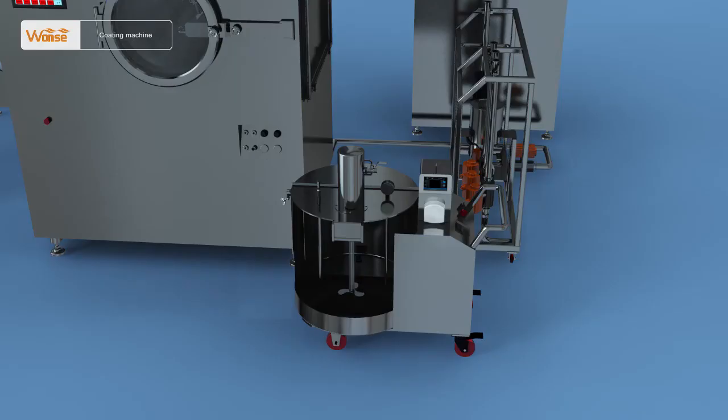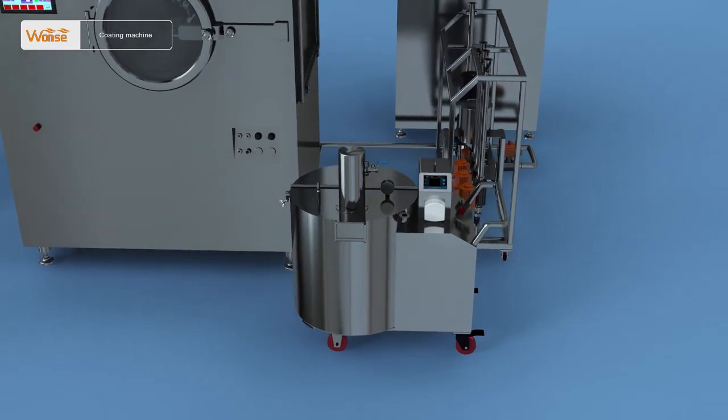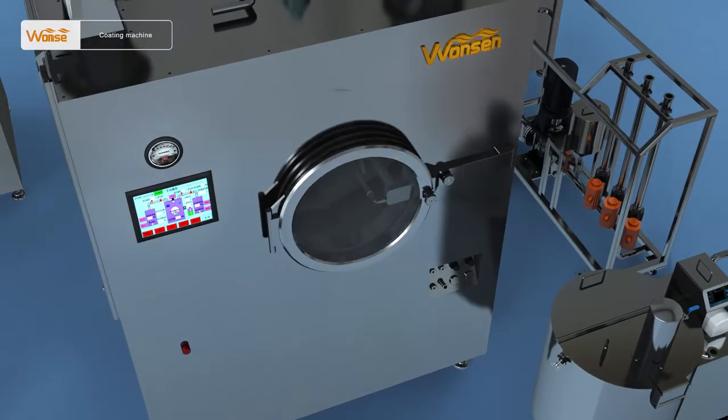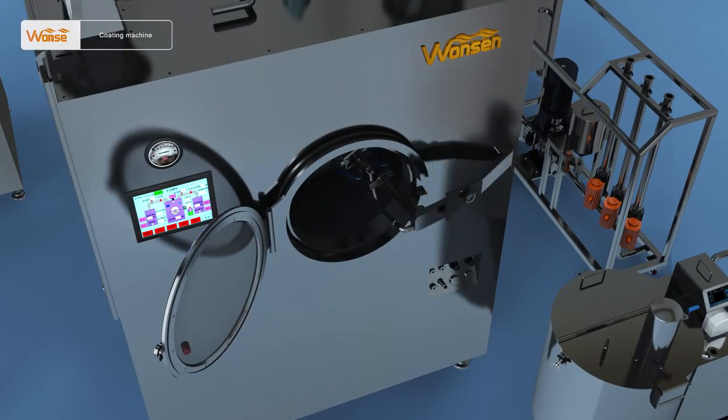The spray optimization system is mainly composed of electric heating, heat insulation mixing tank, constant pressure variable peristaltic pump, and spray gun components.